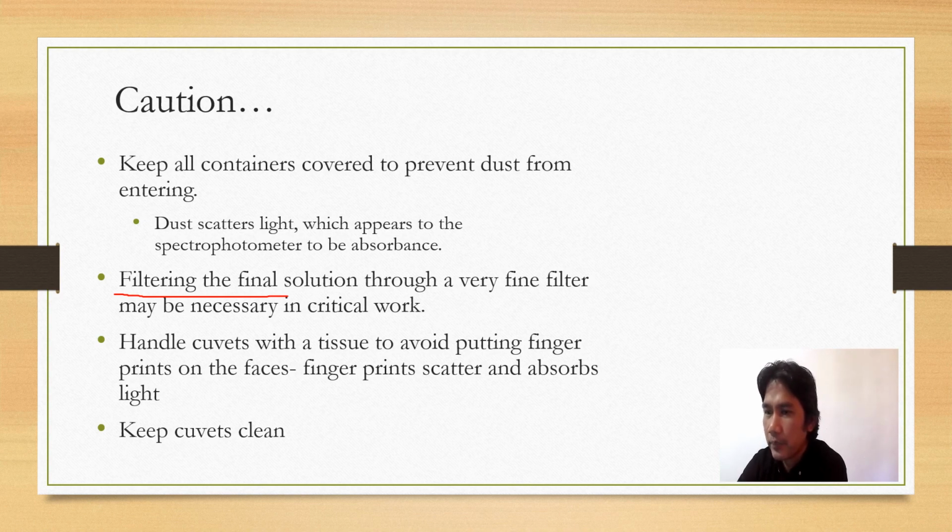So I mentioned this in the demonstration, no? Wipe the cuvette above the marking line. Okay, and keep the cuvettes clean before using.